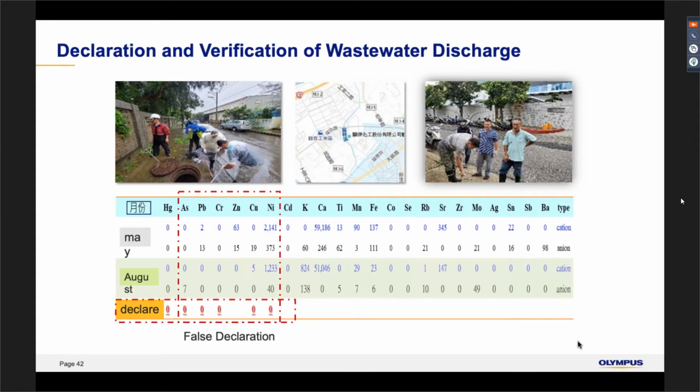Out in the field, the XRF will be the perfect tool to give you an understanding on the spot of the levels of heavy metals in the wastewater. But like what Prof. Chang shared just now, ultimately when it comes to the enforcement stage, they will need to send the sample to AAS and ICP to get the final report. Right, Prof? Right.